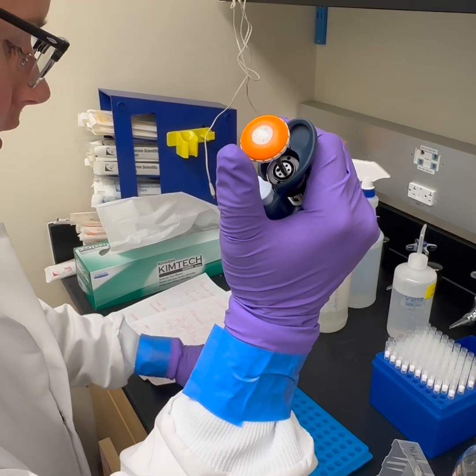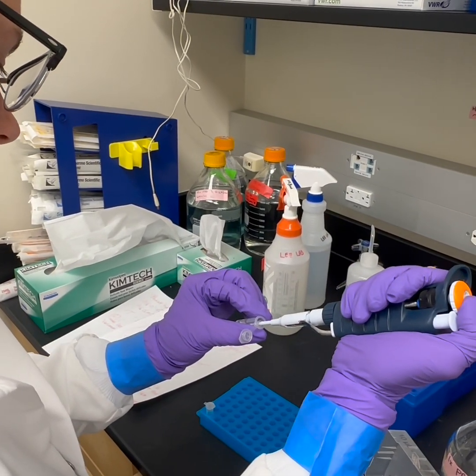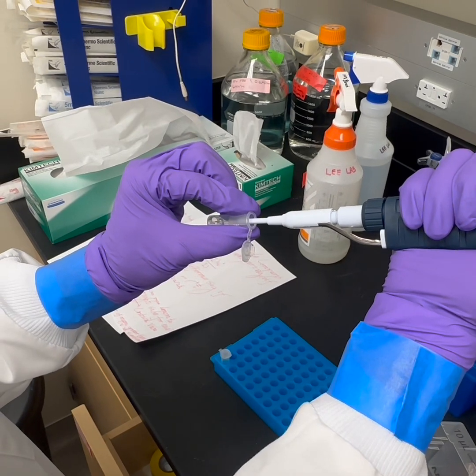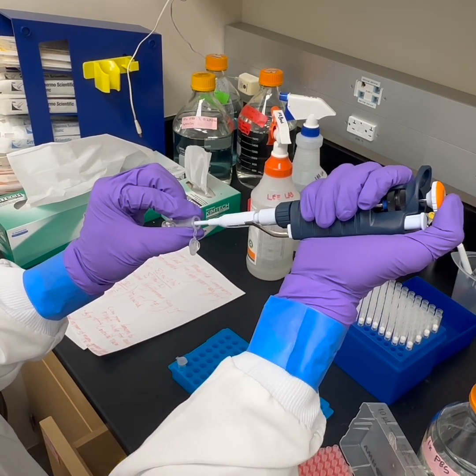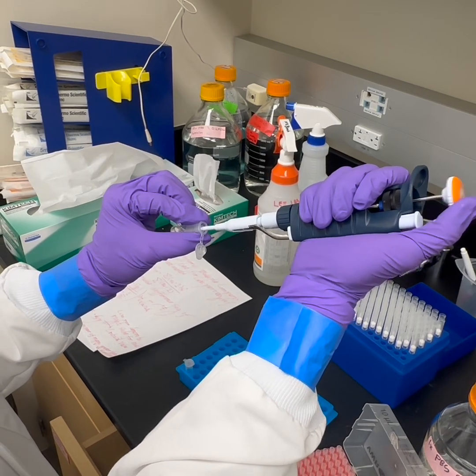All right, so I'm going to take this mixed stuff and add it to here. There's going to be some residual cells, so you'll want to mix it with the tip to wash that residual mixture off of the pipette tip, especially with such low volumes.